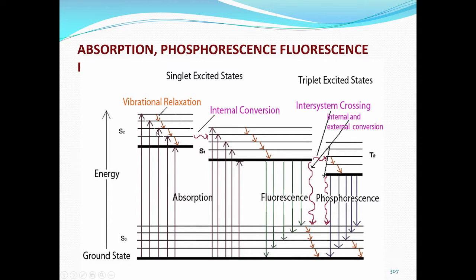And as I have told you earlier, the energy absorbed is released through several vibrational and rotational energy levels and comes back to the ground state of the excited energy level, which I have shown as a bold line here. From here the return will be to the ground state, any one of these states, but mostly populated on the bold line which I have drawn at the bottom nearest to 0.